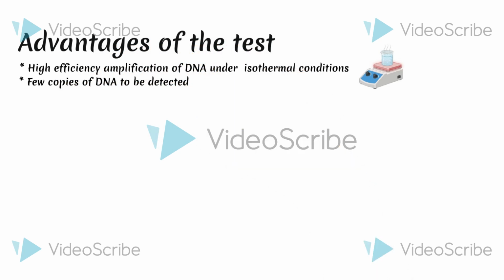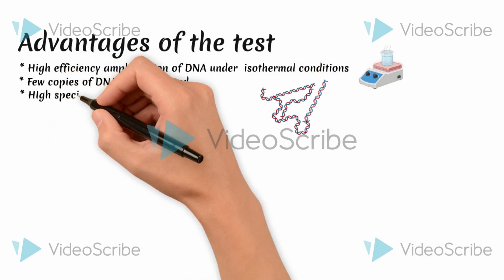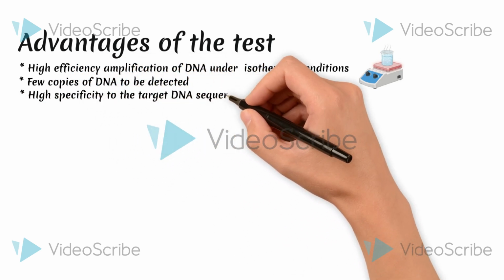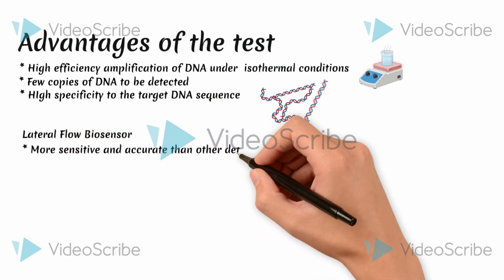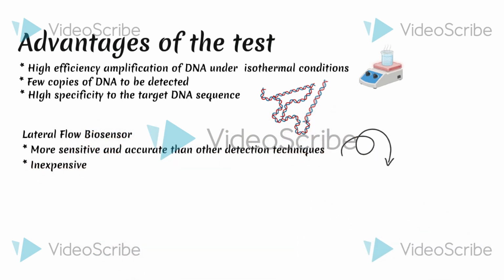On the other hand, the lateral flow biosensor is more sensitive and accurate than agarose gel electrophoresis, colorimetric indicator, and real-time turbidity, and it is also simpler, faster, and not expensive. However, there is a limitation for the detection of Haemophilus influenzae by the LAMP lateral flow biosensor, since the LAMP results are shown qualitatively by red strips.